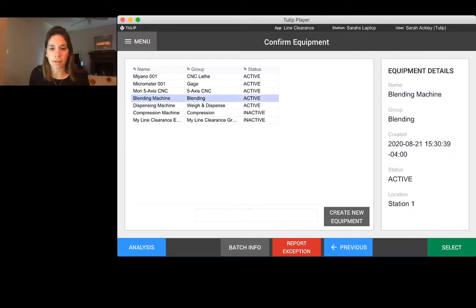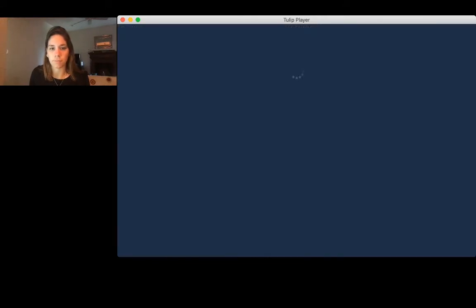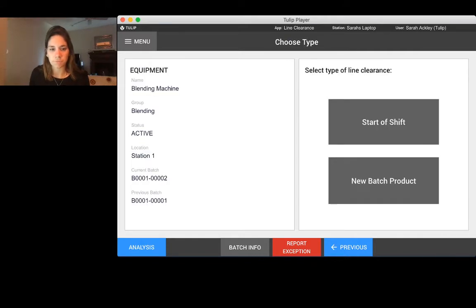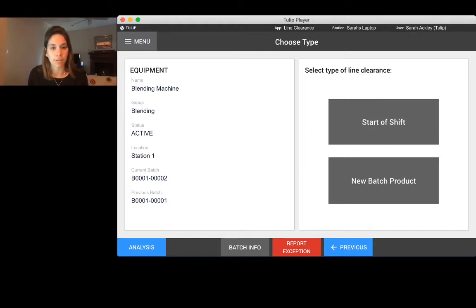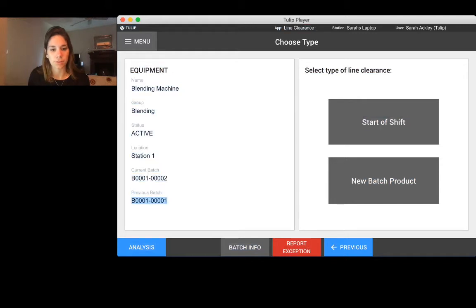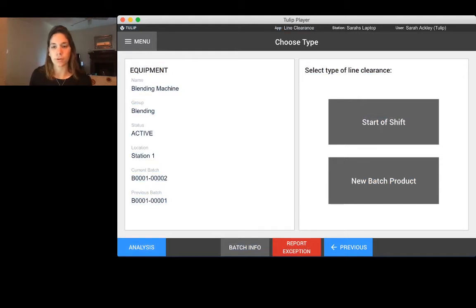I go ahead and I click the blending machine, I click select, and the cool thing about TULIP because it is a digital record, it's going to keep and store the last line clearance that you performed on that particular piece of equipment. You can see here the previous batch was 0001 and now we're running 002.